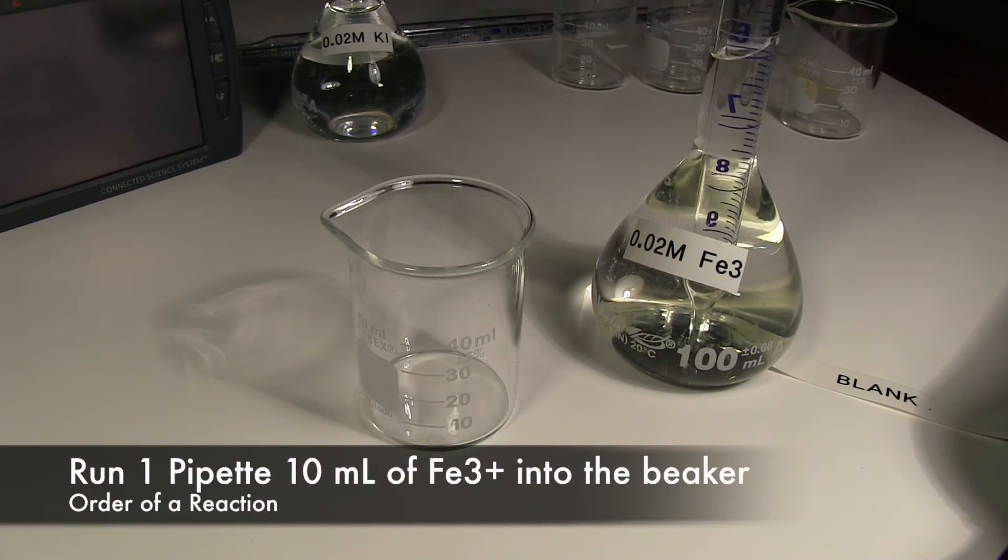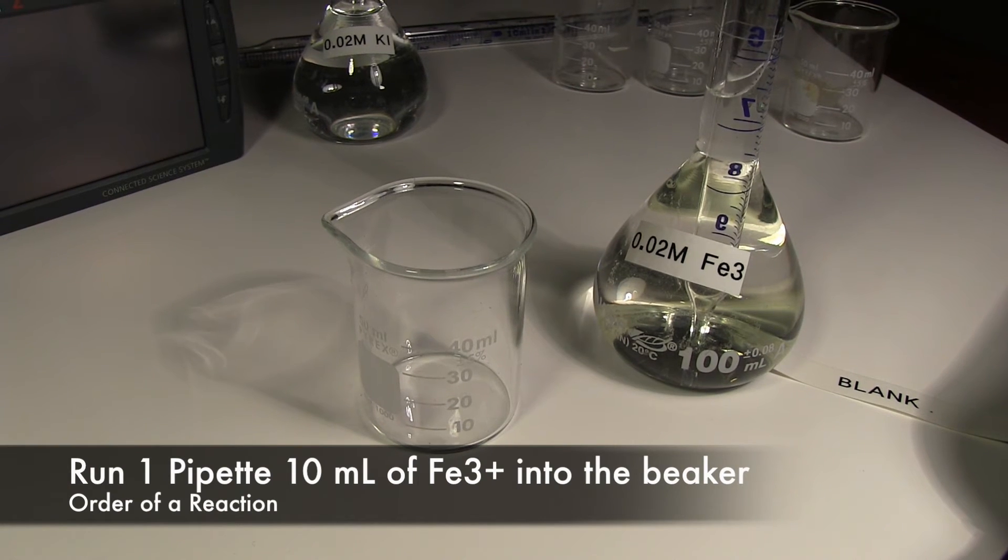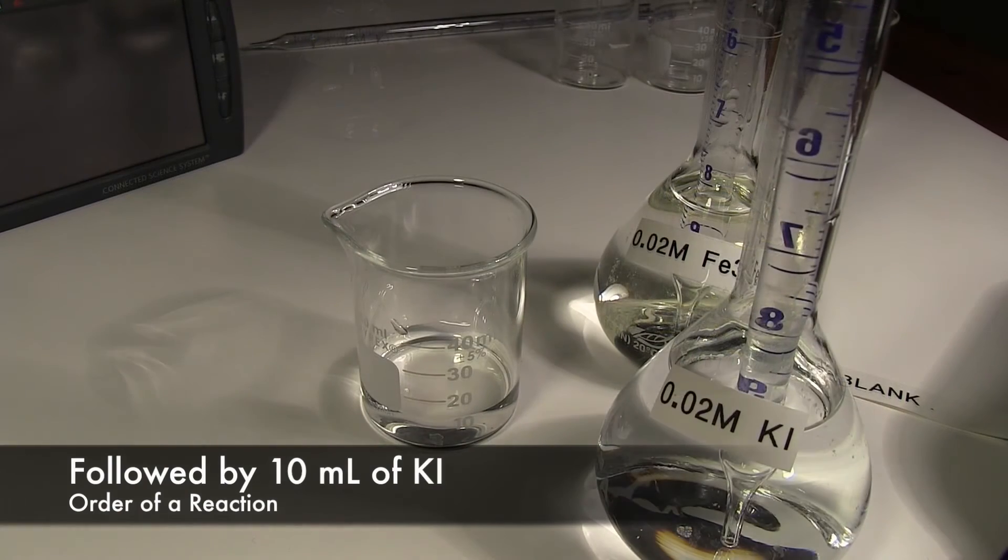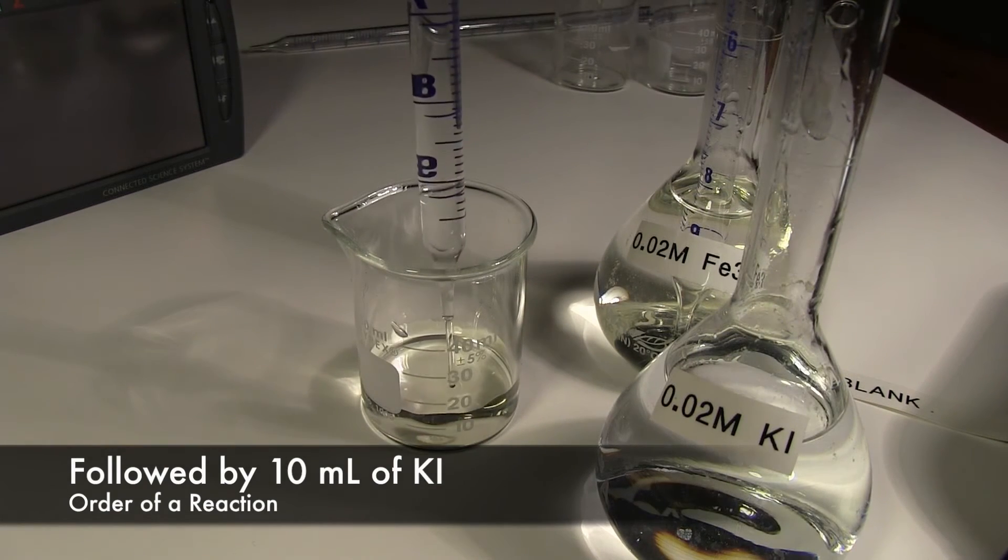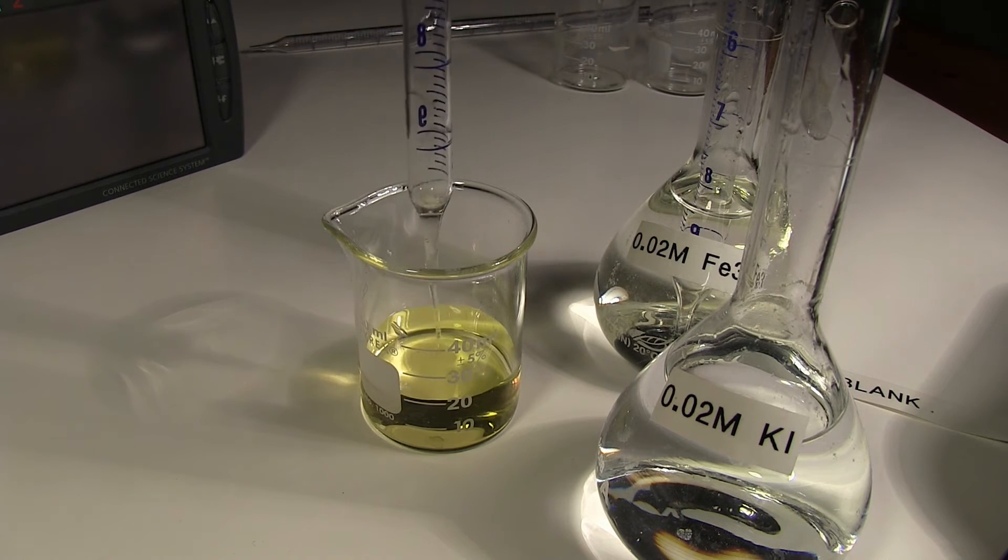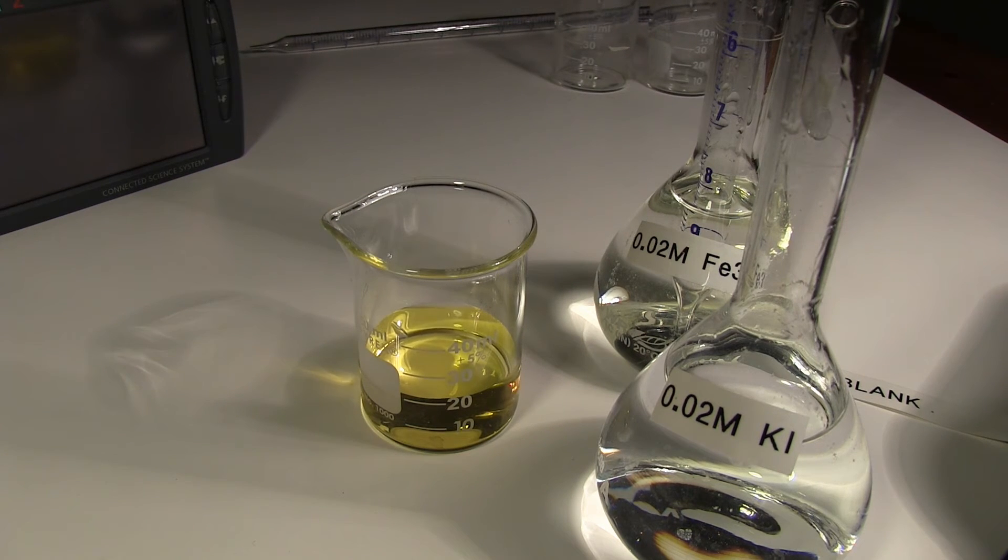Run 1. Pipette out 10 ml of iron 3 solution into the beaker, followed by 10 ml of potassium iodide into the same beaker. Keep the time consistent between mixing of the two solutions and data collection on the LabQuest for all three runs.